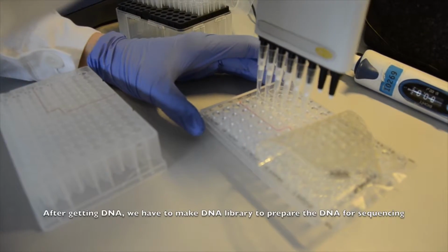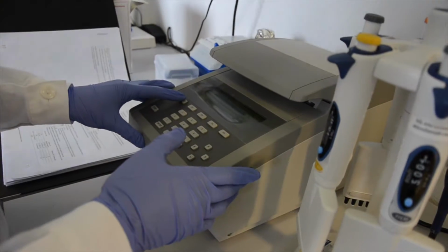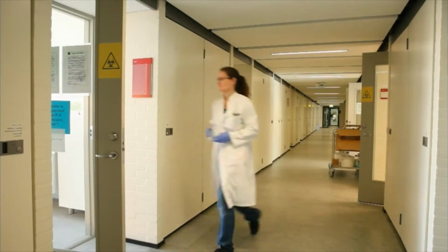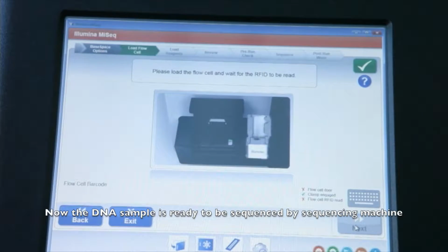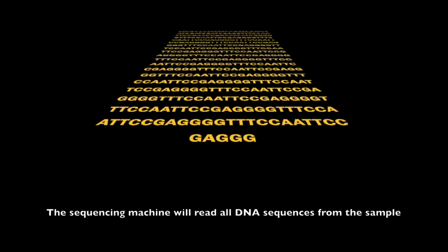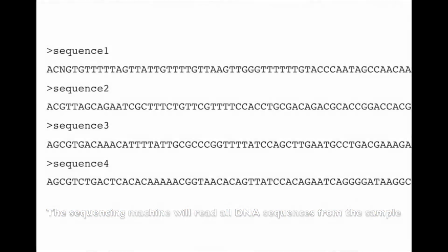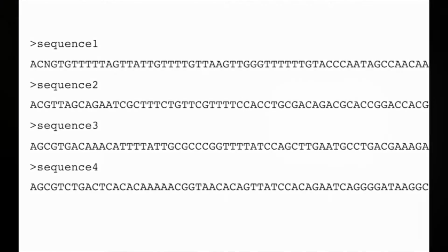After getting DNA, we have to make a DNA library to prepare the DNA for sequencing. Now the DNA sample is ready to be sequenced by a sequencing machine. The sequencing machine will read all DNA sequences from the sample and store the DNA information in a text file.